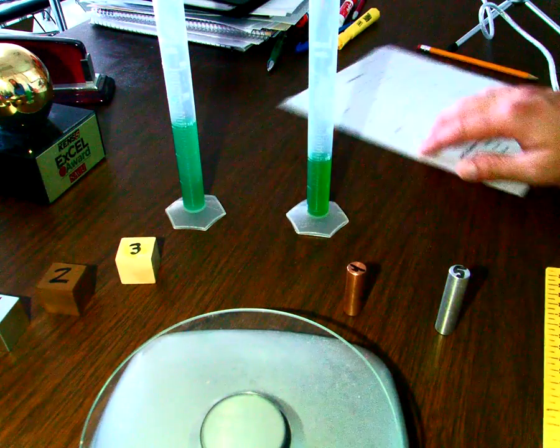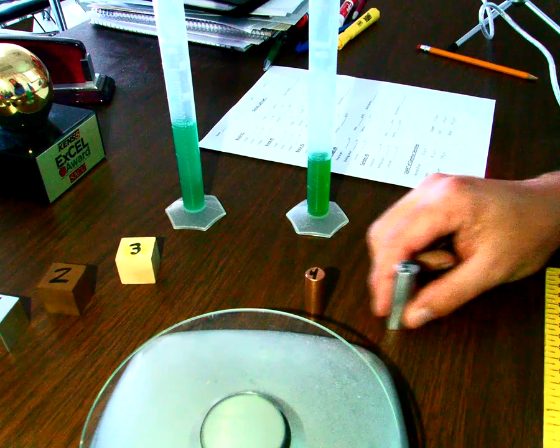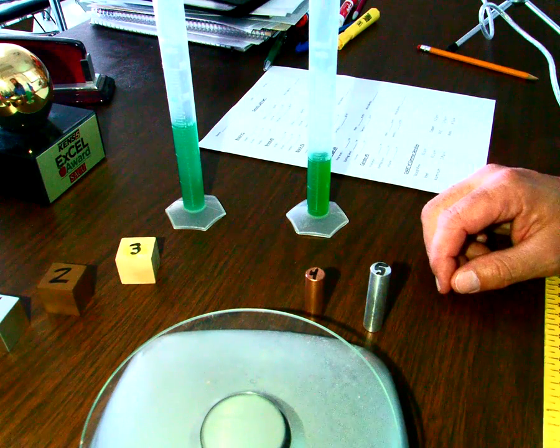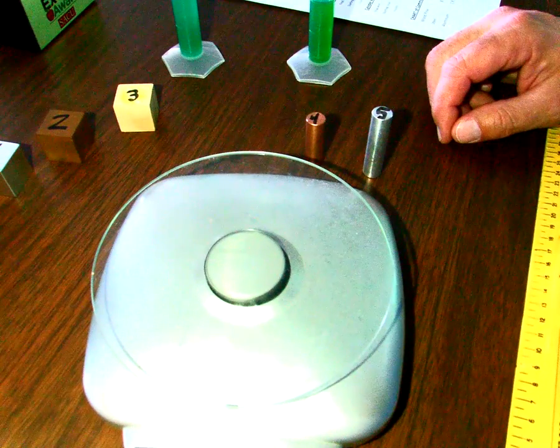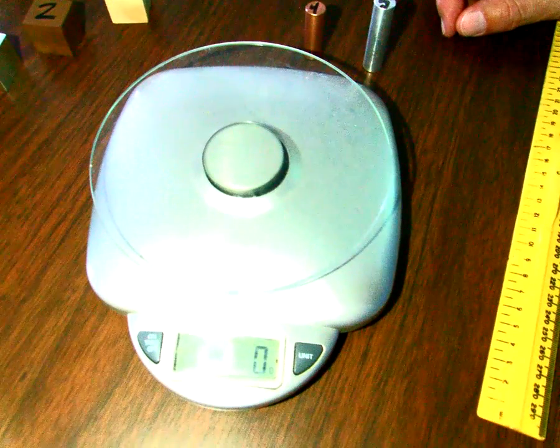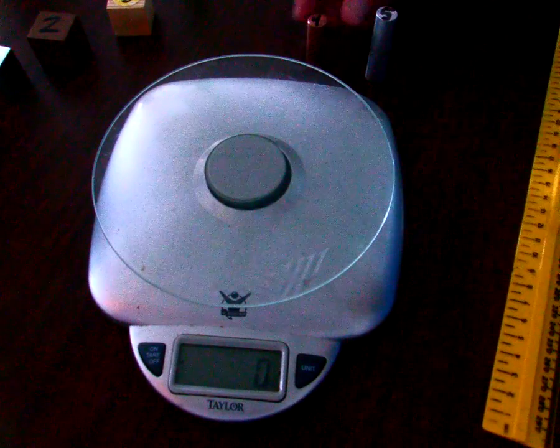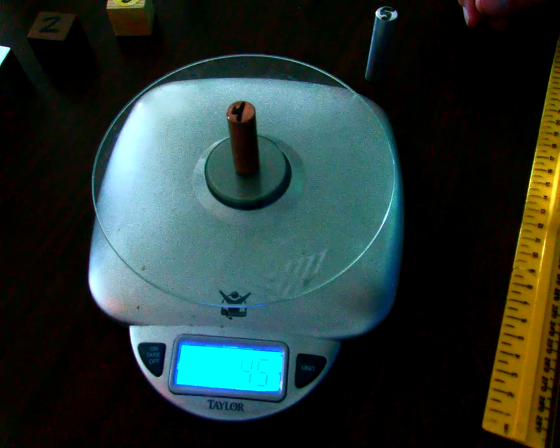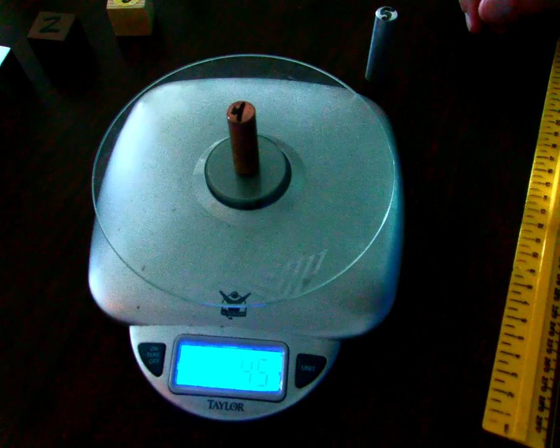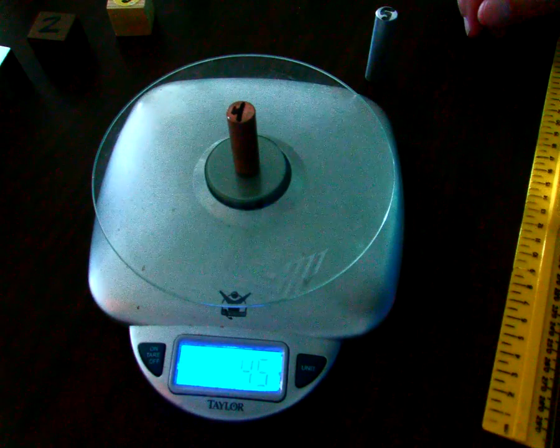So the first thing we're going to do is mass out our 2 cylinders. We have cylinder number 4 and cylinder number 5. Notice they are a little bit different in size. Number 5 is a little bit taller. But let's go ahead and see what our mass is. Our mass for cylinder number 4 is 45 grams. Go ahead and record that on your data sheets.